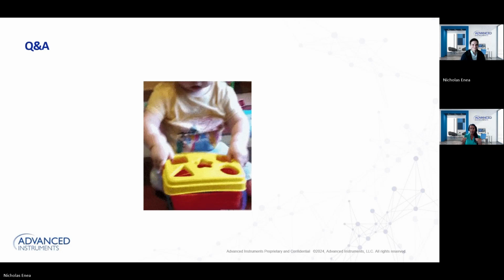Then they start getting real-time data on how pipettes perform within their laboratory environment, and they have to broaden those tolerances. That can be a little sticky when it comes to auditors and inspectors who ask for justification on why you started with one tolerance and then had to broaden it to another. So I suspect that might be what Tracy's referring to: make sure your SOPs reflect what you're actually following and how you're calibrating your pipettes.